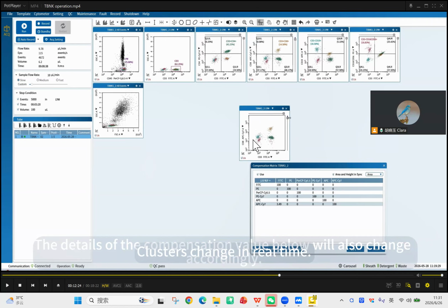These group cells are negative in this channel and CD8 negative. So the line connecting the centers of these 2 groups should show the same position on the y-axis. It means the line connecting the 2 groups should be parallel to the x-axis, like this.